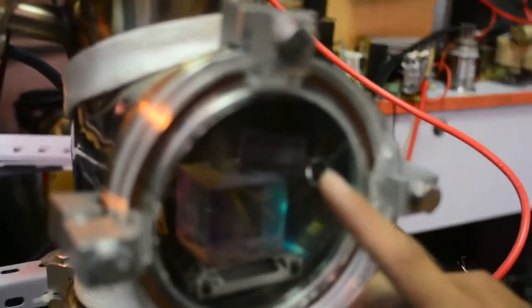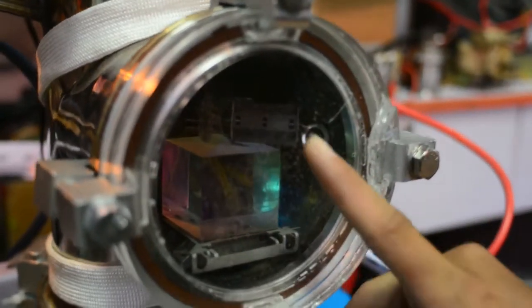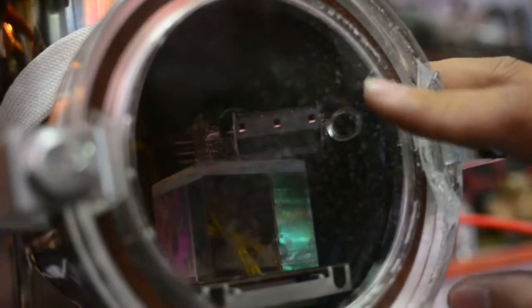You can see this vacuum tube is hooked up to the low voltage vacuum connector cable. I will apply a DC voltage to this filament.